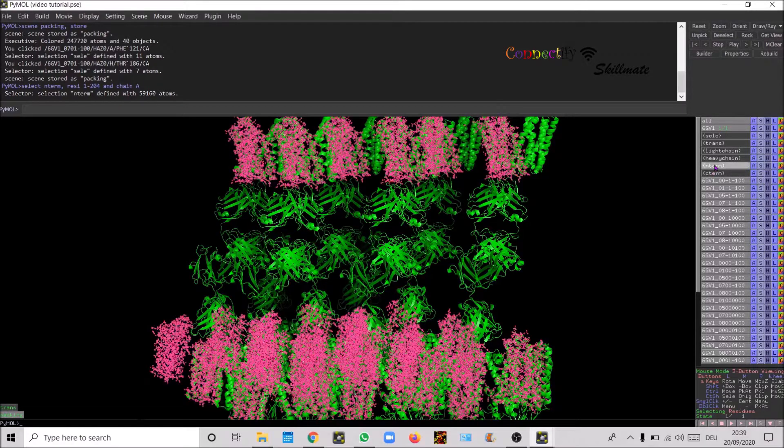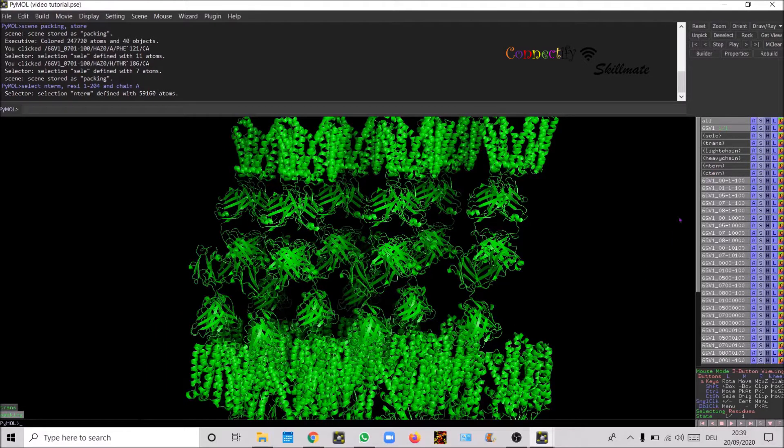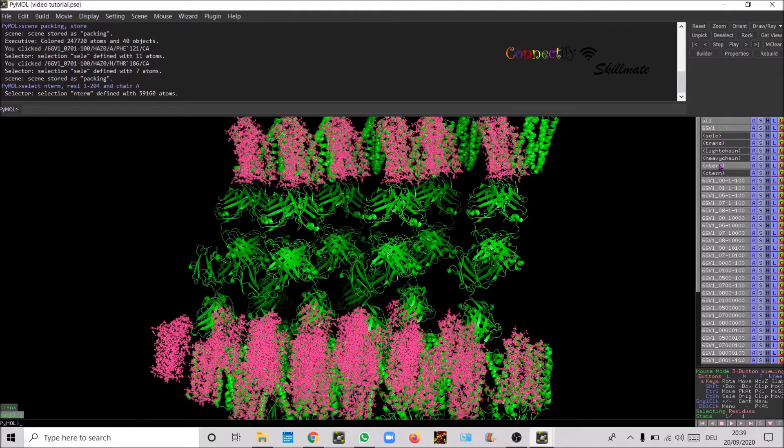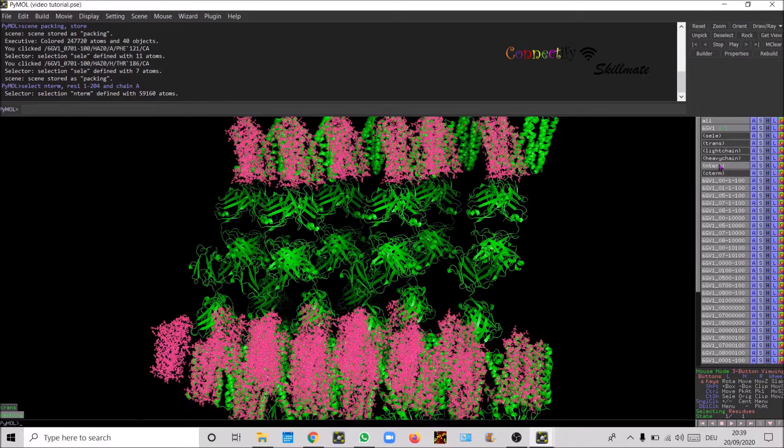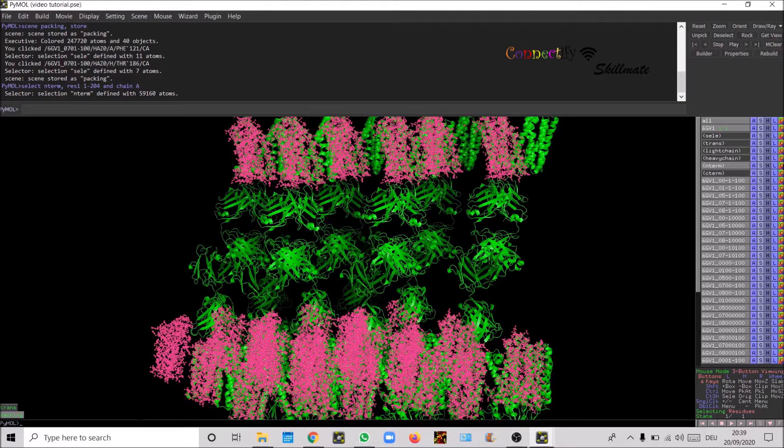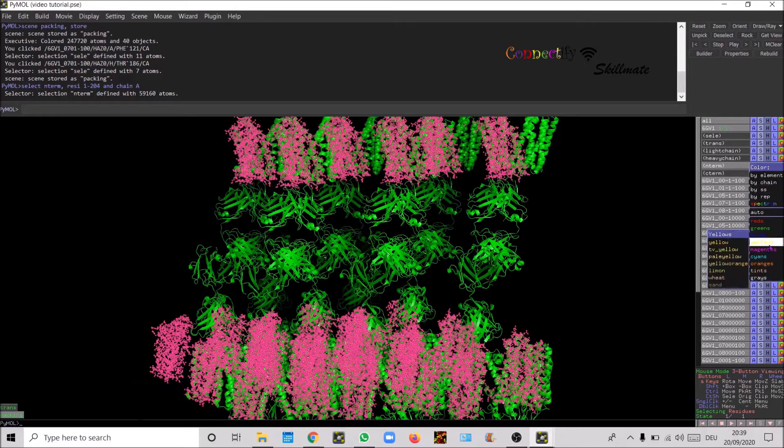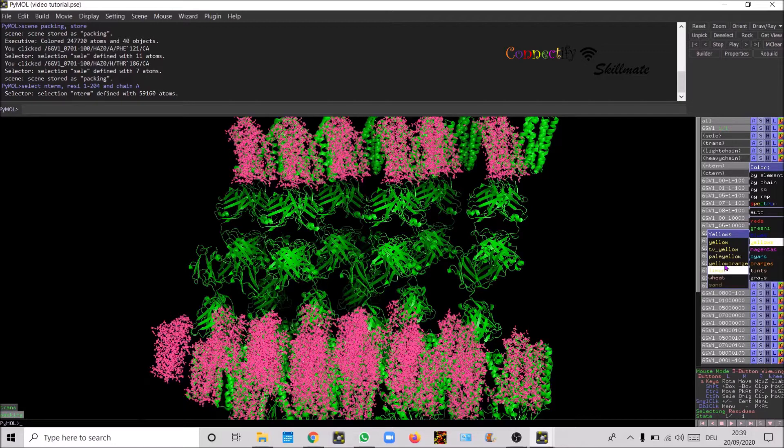Now it's gonna restore and then so now it's selected all the N-term. I already know that the N-term belongs to chain A so I defined the N-term. Now I'm gonna color it, say lemon.